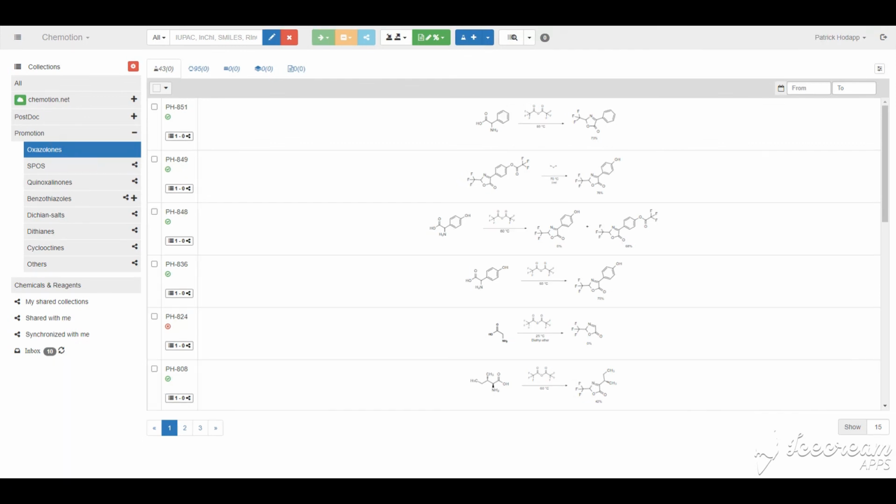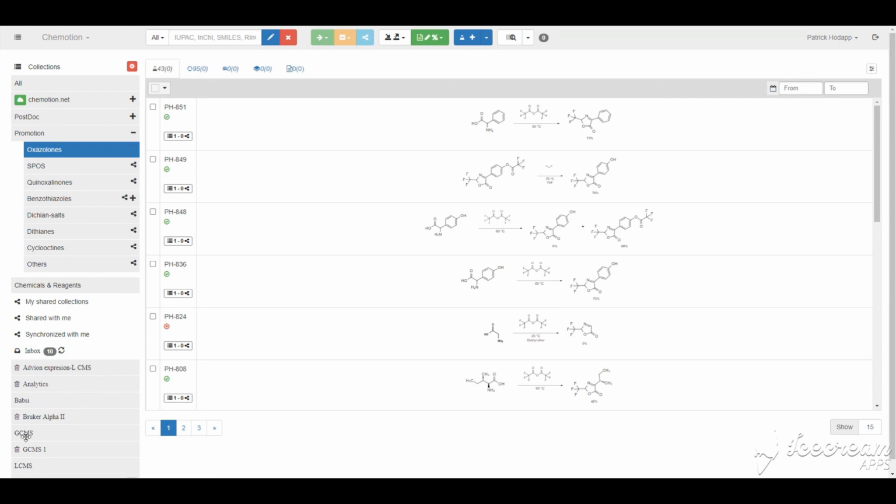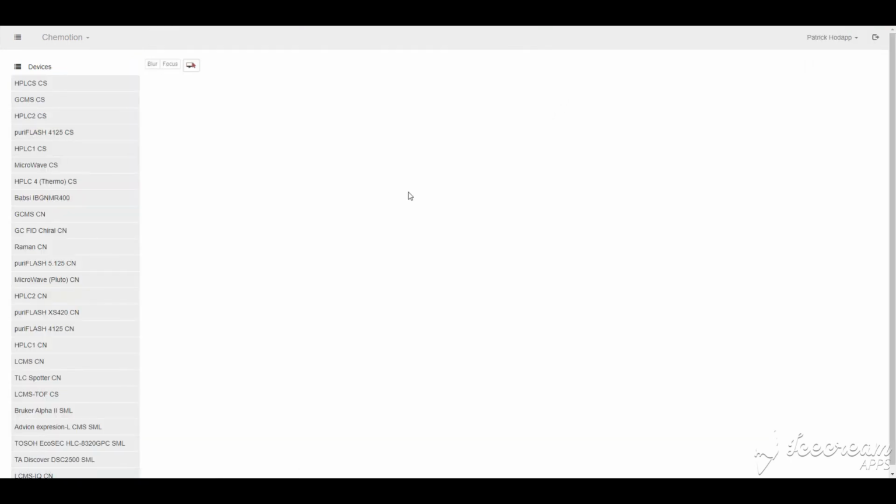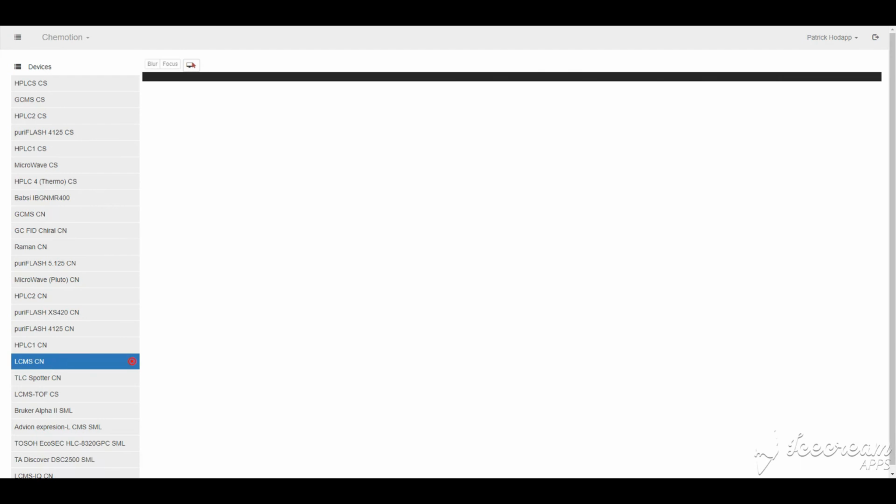Now, since we already covered the analytical data in the reactions, and I mentioned that when devices are integrated, you see the analytical data, or the experiment data, sent to you by the devices in your inbox, let's look at the device list that I mentioned at the very beginning of the video, because you can not only receive the data from the devices, you can also control these devices remotely. Once you enter the devices list, on the left-hand side, you will see a list of all the devices integrated into the ELN. And let's just open one example, one of the LCMS devices in our lab.